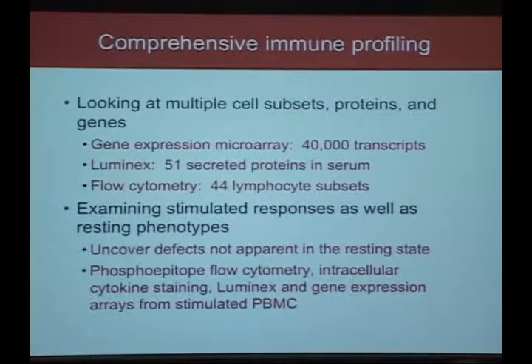And part of the goal here is to do assays that have a functional component that stimulate the cells in vitro and read out something beyond the resting state, because that's, as the Nolan lab has shown in a number of different disease states, can uncover things that you don't see otherwise. And so examples of those kinds of functional assays are listed here.